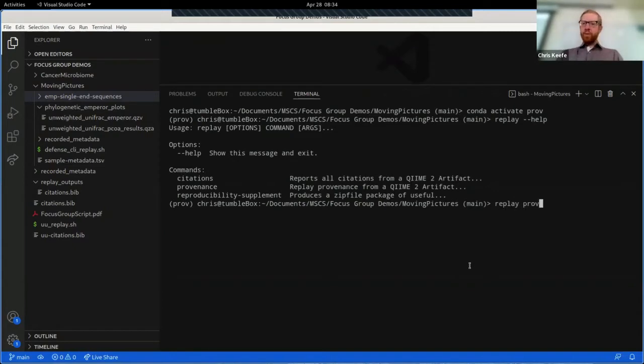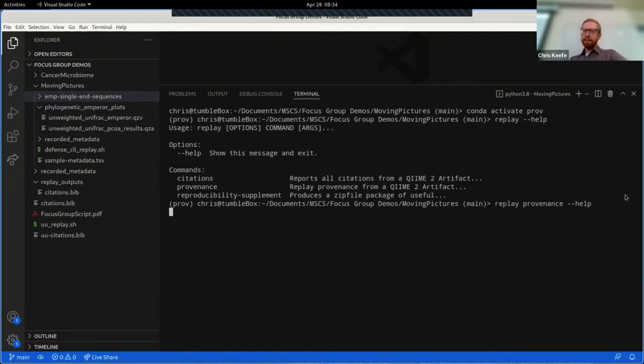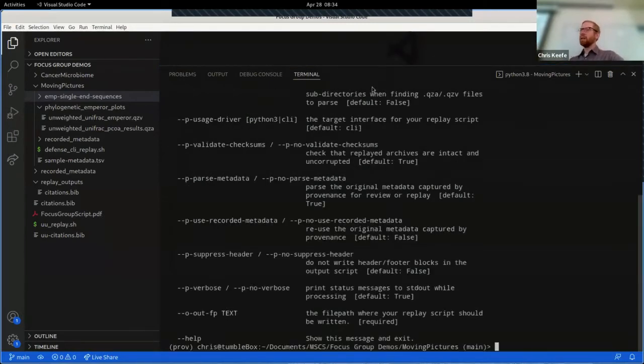We're going to for this demonstration use the replay provenance command. This is a small chunk of what we can do with provenance replay, but it is kind of the meat and potatoes of what we really need to do here.